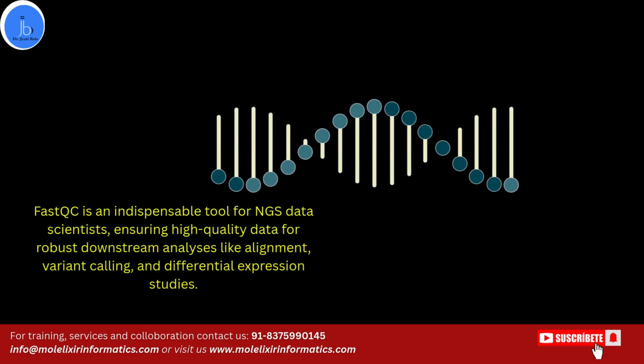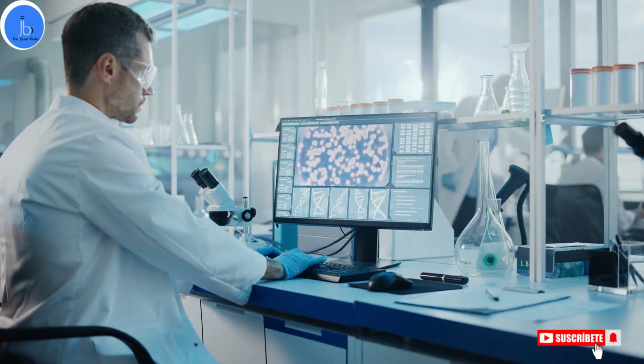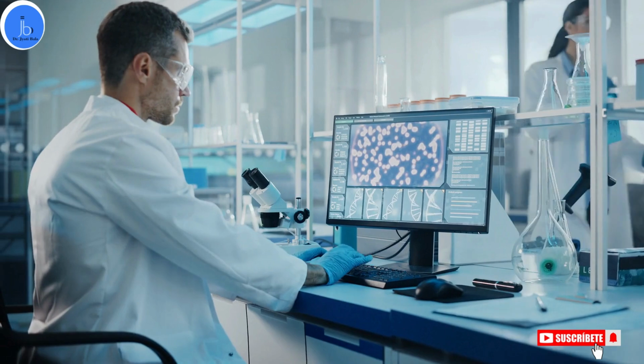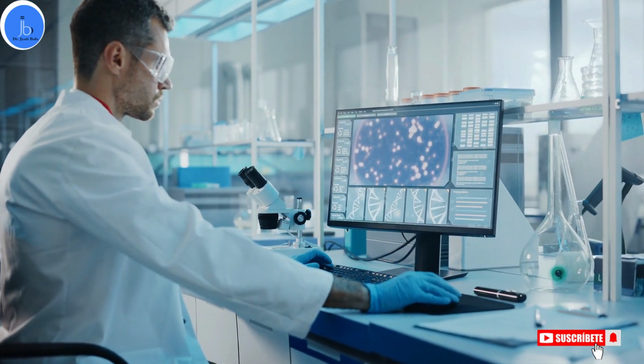FastQC is an indispensable tool for NGS data scientists and bioinformatics professionals working in the areas of genomics. FastQC ensures high-quality data for robust downstream analysis like alignment, variant calling, and differential expression studies.